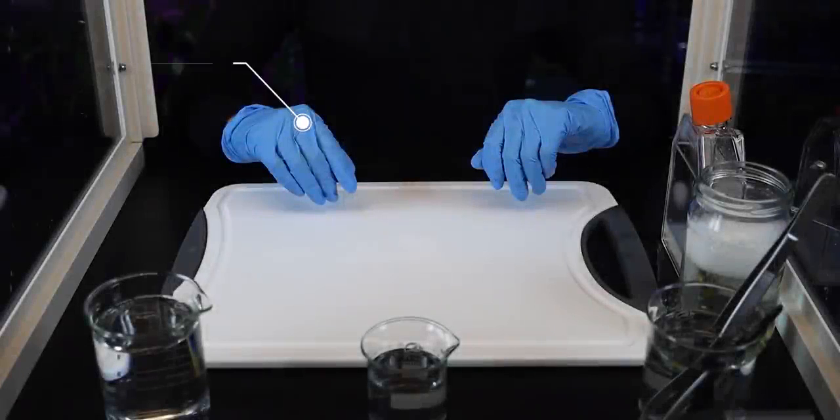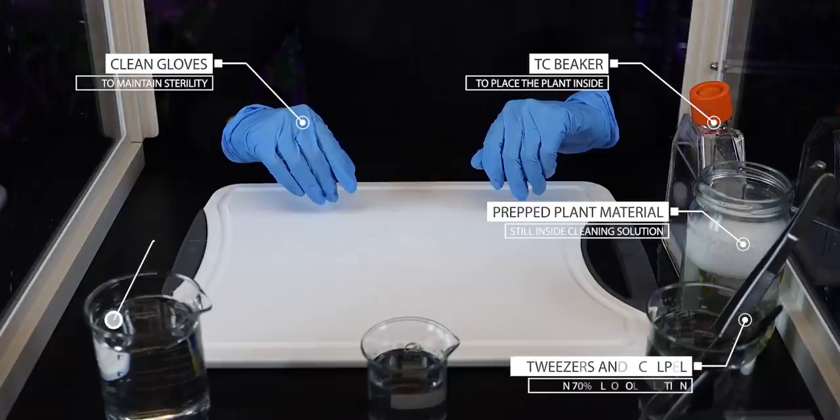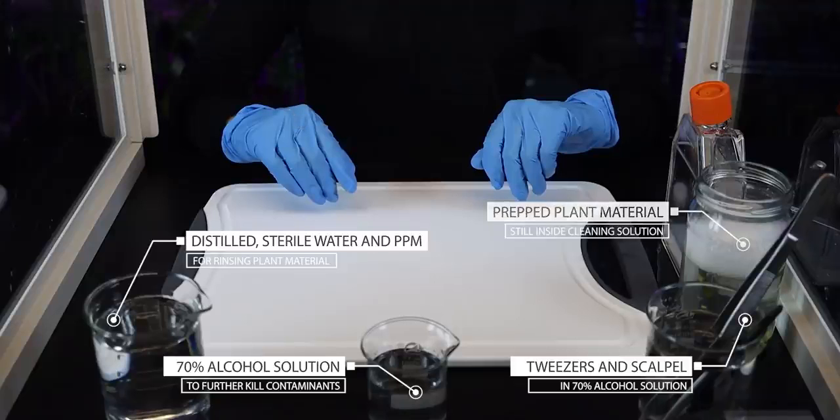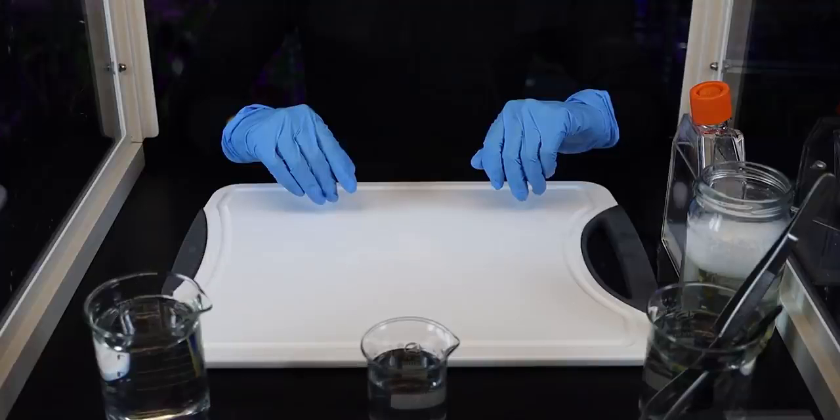Okay, here we go. It's now time to perform the actual tissue culture procedure. Here we are inside the laminar flow hood with everything we need to carry out this process. I've changed my gloves and they've been sprayed with 70% alcohol, as has all of the equipment in the laminar flow that you see before you, so it is all sterile.